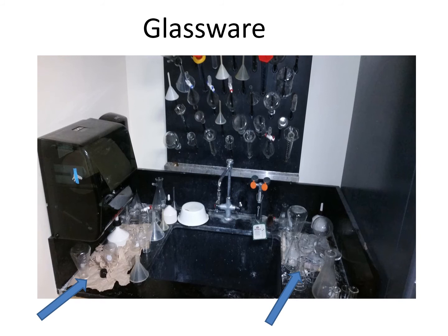All of the glassware you see around that sink, that's hazards. We don't know if it's clean. We don't know if it's dry. We don't know if someone just put it there. No idea. So that's something you got to watch out for.